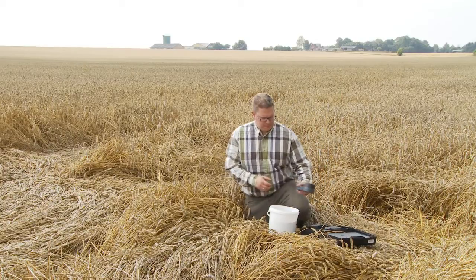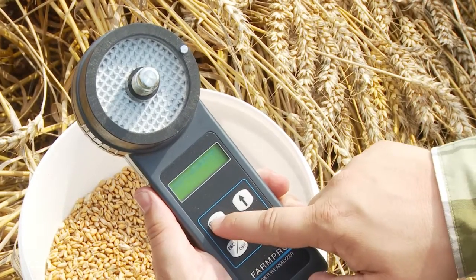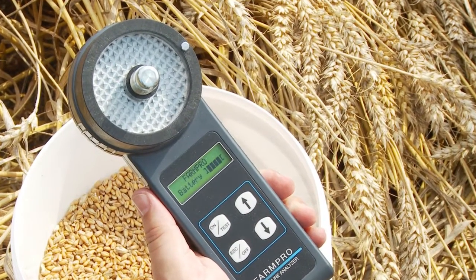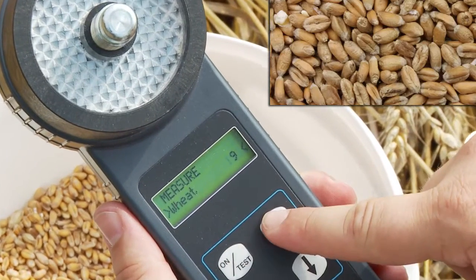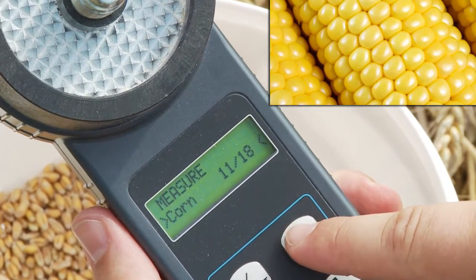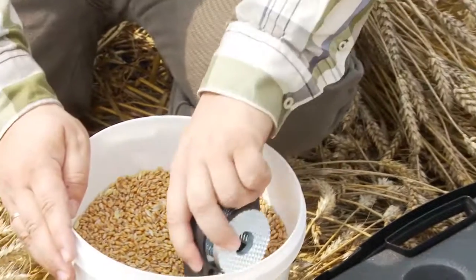FarmPro Moisture Analyzer is easy to operate. First you switch the FarmPro on, then you choose the right crop using the arrow keys. FarmPro has up to 20 crops pre-programmed depending on the crops grown in your area.